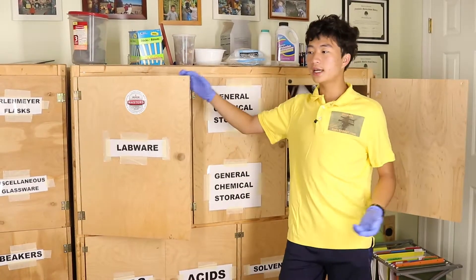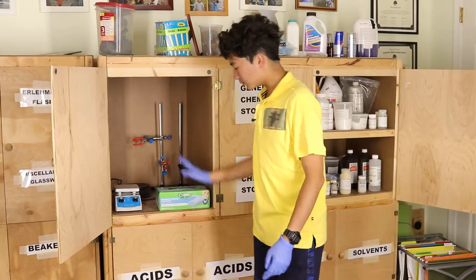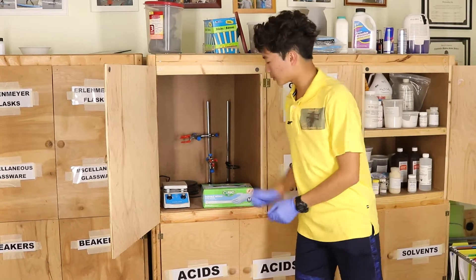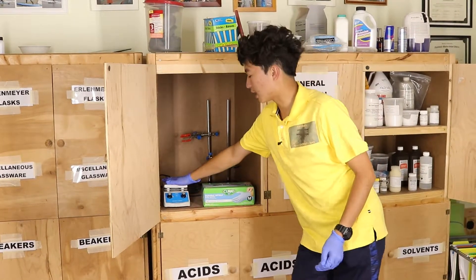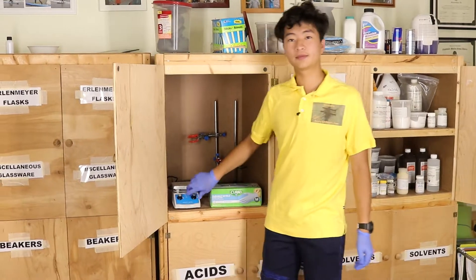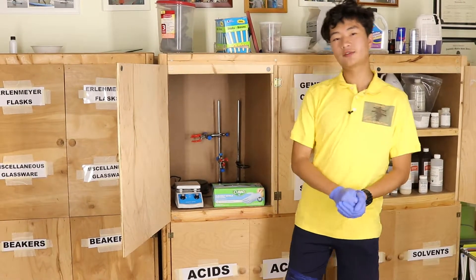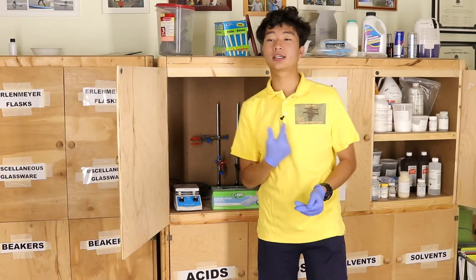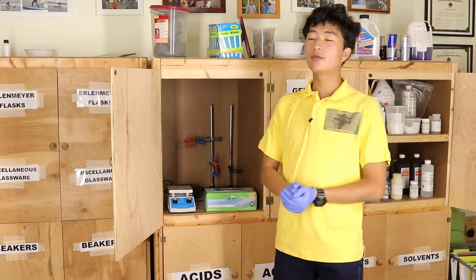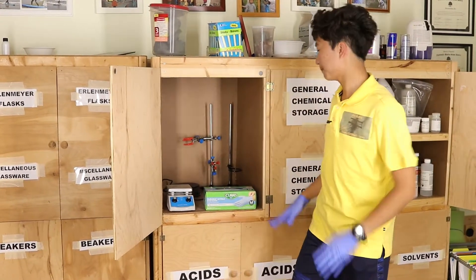We're on to the chemicals and some of the hardware. Starting with lab wear — gloves are very useful, I'm wearing one right now. Of course there's the hot plate stirrer with two settings: stirring and heating. The heating element is on top, and stirring uses a rotating magnet that causes that little tablet-shaped stir bar to follow the magnetic field and stir without contacting the fluid directly — very useful.